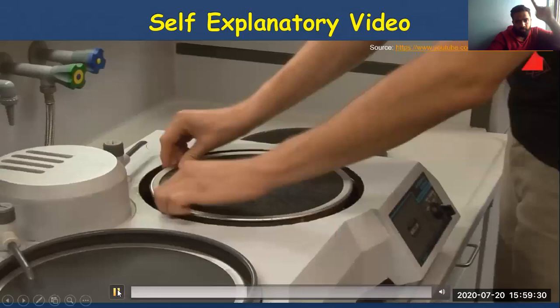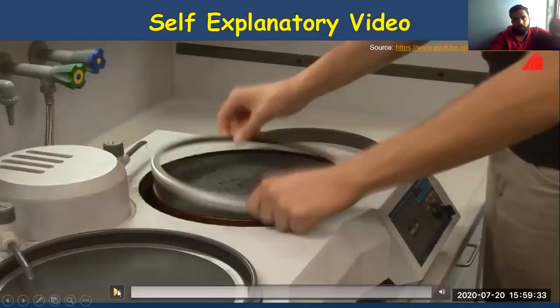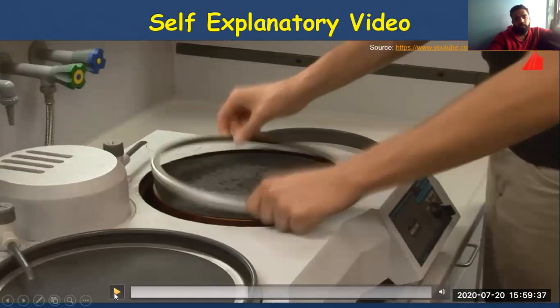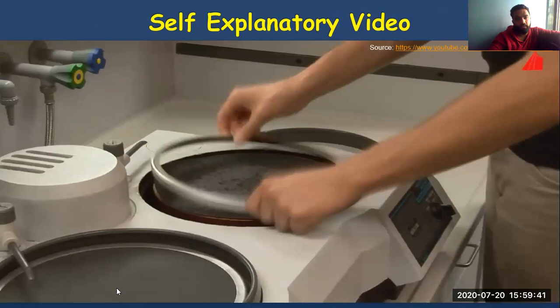First was the coarse paper. Coarse paper he used. Now he is going to use the fine paper. Okay, we are going just step by step. The thing is, they are having very high professional instruments. These instruments are not even there in the college.